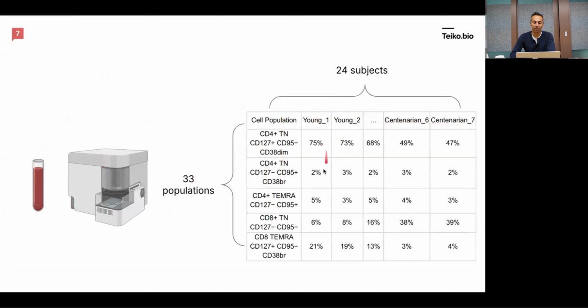And you can see here the percentages, which are the percentage of the immune state captured by this particular cell type that this person had, like 2%, 3%, etc. So these rows and columns are what we're going to do principal component analysis on.